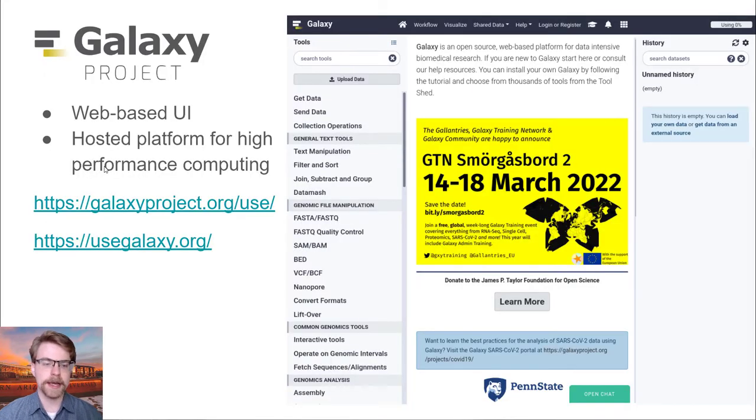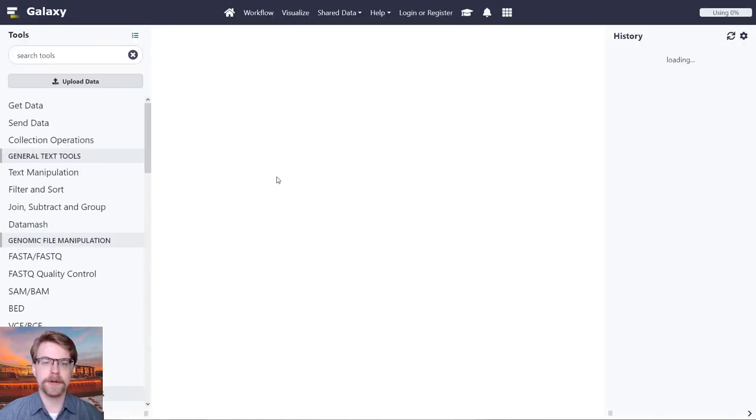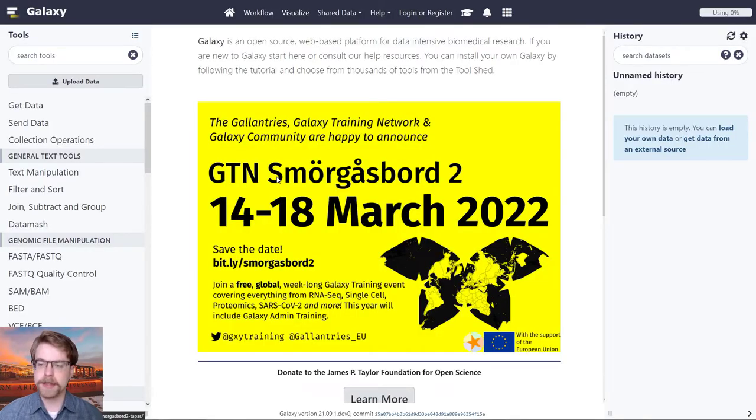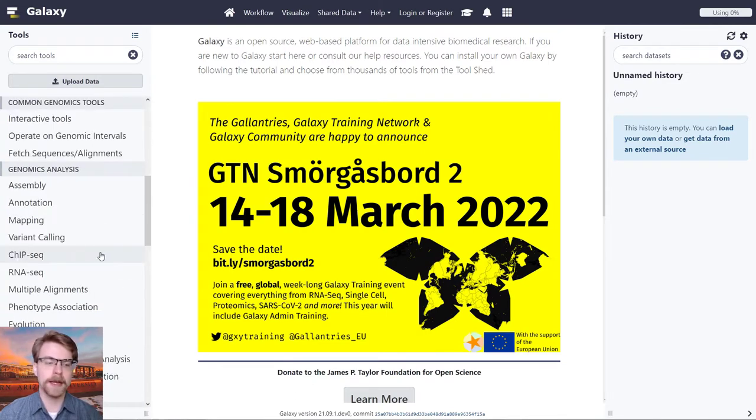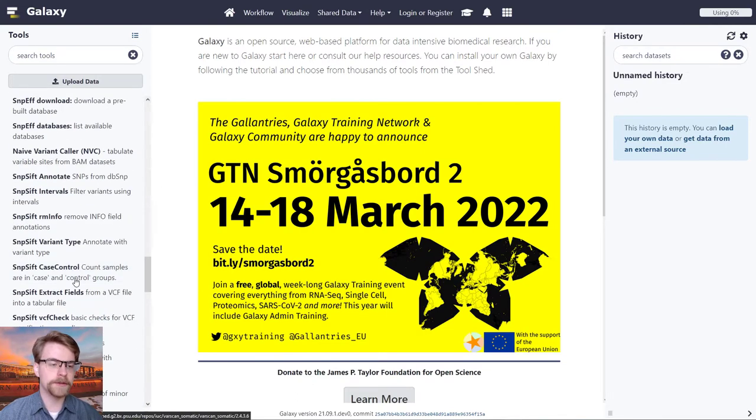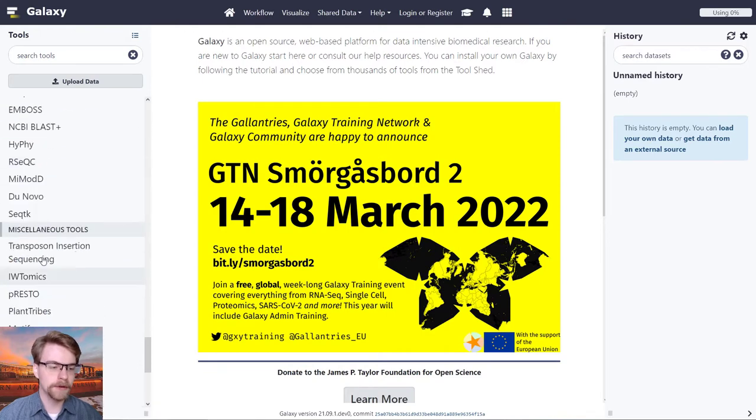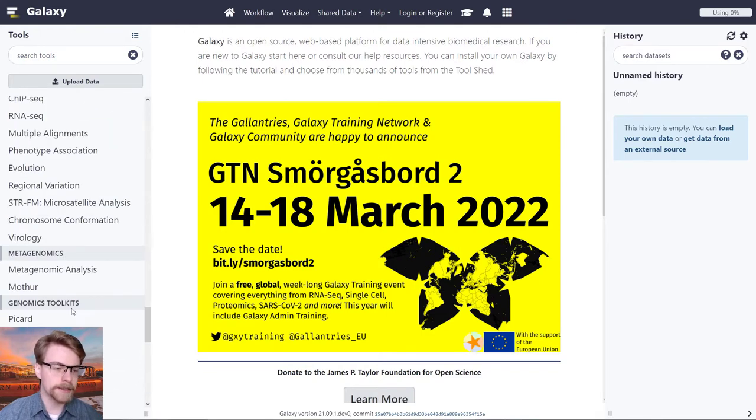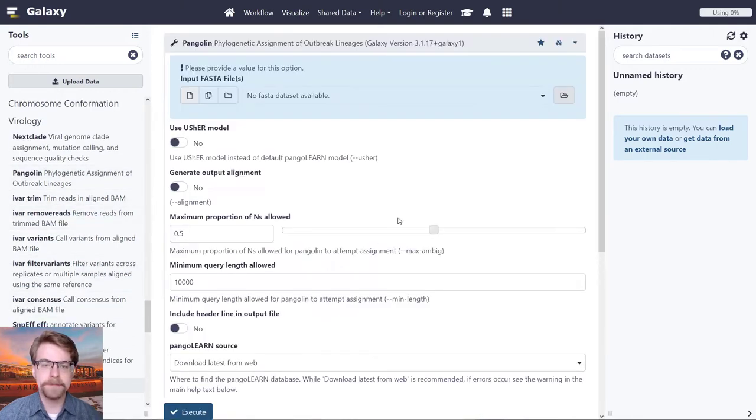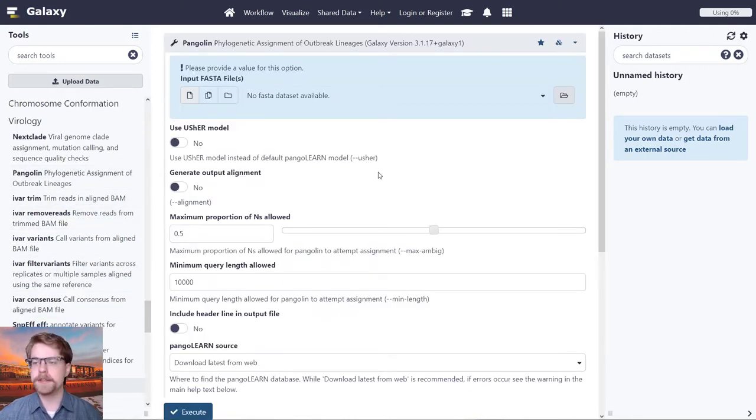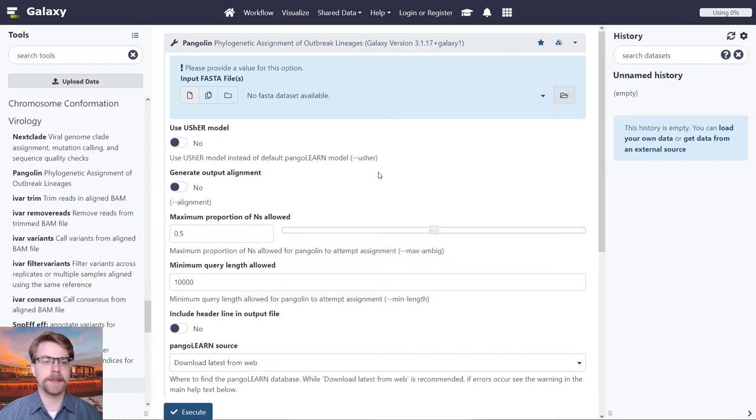In addition to that, there's probably the most well-known one, which is usegalaxy.org. When you think of Galaxy, this might be what you're familiar with, and it comes with a variety of well-known tools. We can look at different kinds of analyses, for instance, virology, and maybe we want to do Pangolin. This is a free server that you can use, and it's probably the best-known one.